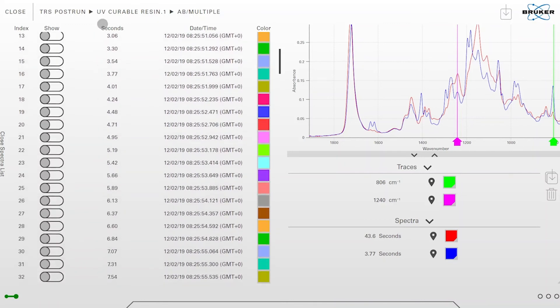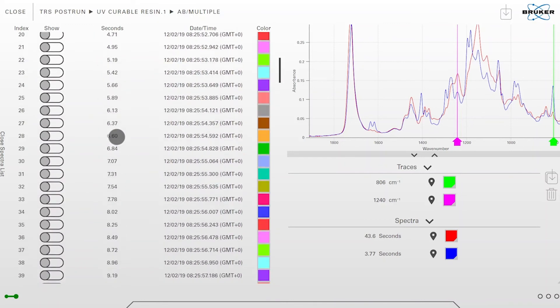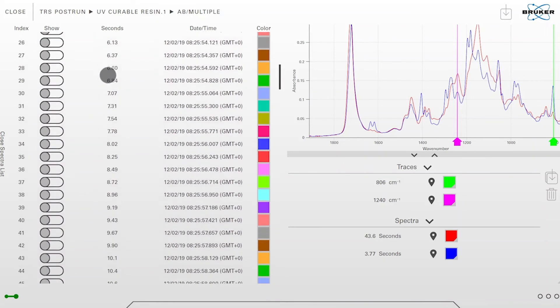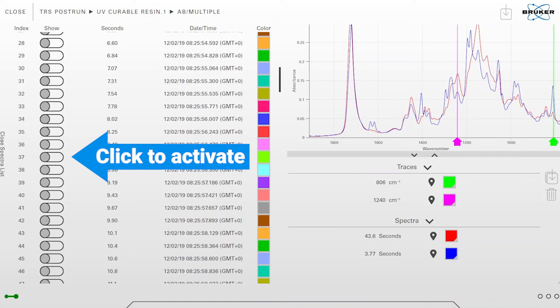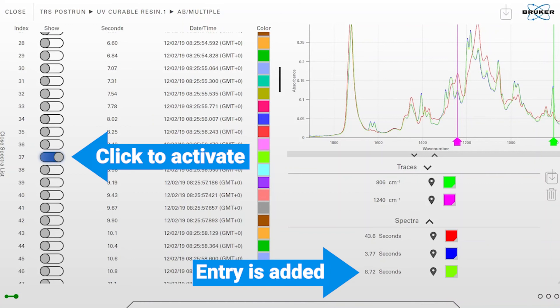And activate specific values, so for example I'm interested in the spectra which was measured at 8.72 seconds. I can activate it via the slider and it's automatically been added in the view at the upper right corner.